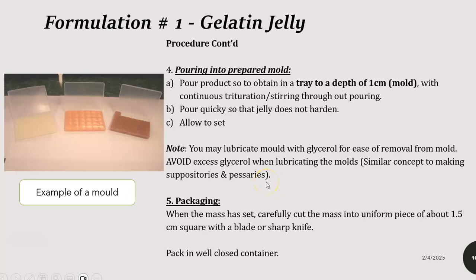How does the patient use this? This is the old technology. You melt it, the patient would remelt it, taking care not to burn themselves, and apply it. I think it's used for varicose veins back in the old days, but I love to use this recipe to demonstrate how we make jellies using gelatin.